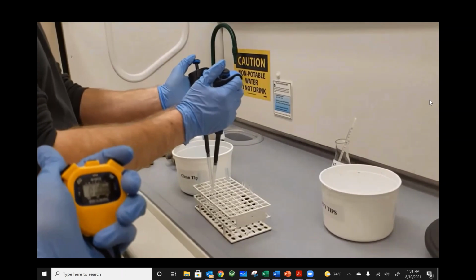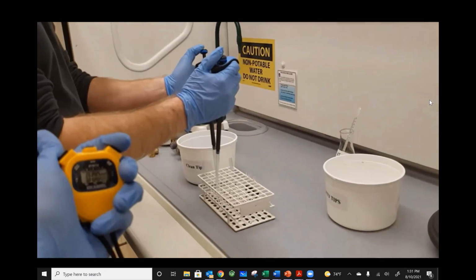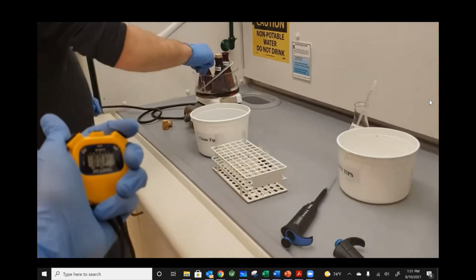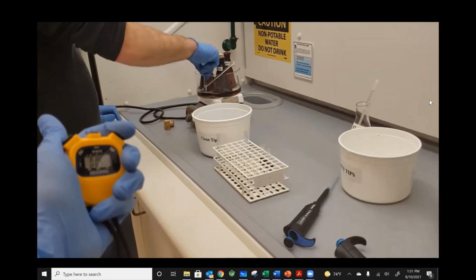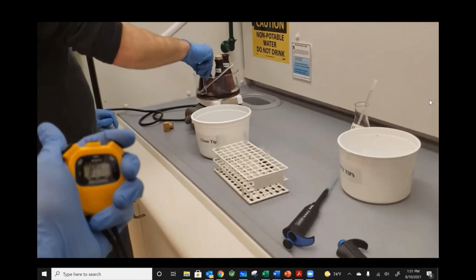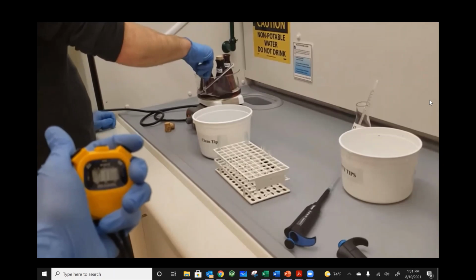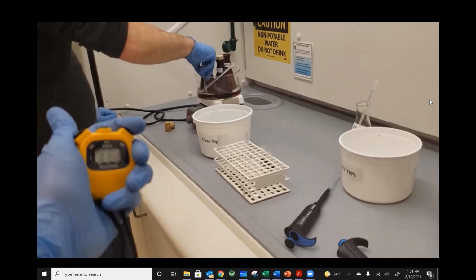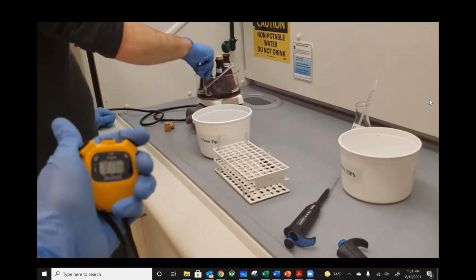Start. I'm clicking start and go. Now, I want to keep the temperature consistent, so I want to have this reaction occurring in a consistent temperature warm water bath, as much as I can here. This should happen very quickly.